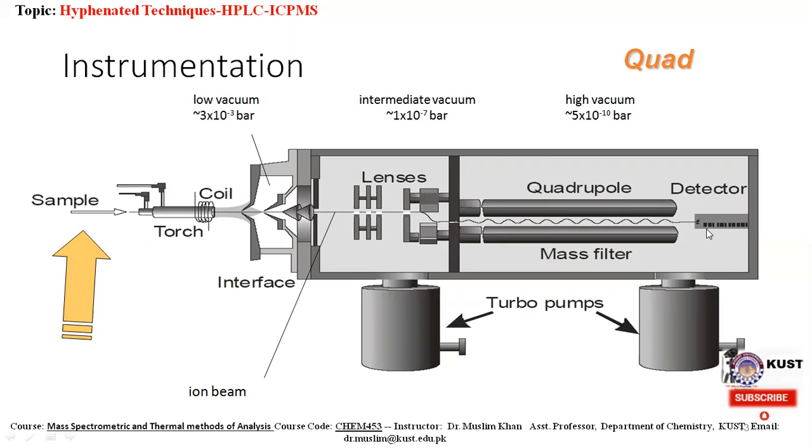There are a number of different ICP-MS designs available nowadays, which share many simple components such as nebulizer, spray chamber, plasma torch, and detector, but can differ quite significantly in the design of the interface, ion focusing system, mass separation devices, and vacuum chamber.